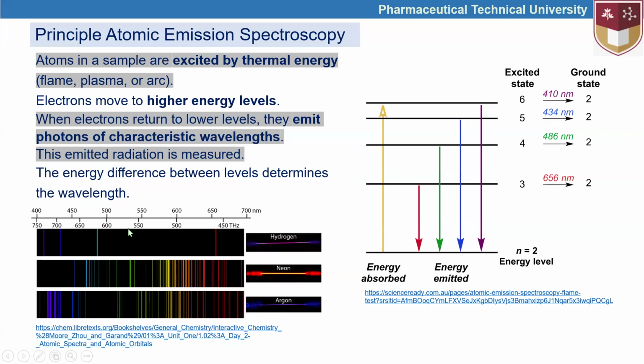Okay, here we can see that hydrogen, the smallest, simplest atom, has four of these bands, while neon and argon have more complex light emission spectra because they have several times greater number of electrons. That's why their emission spectra are more complex and diverse.